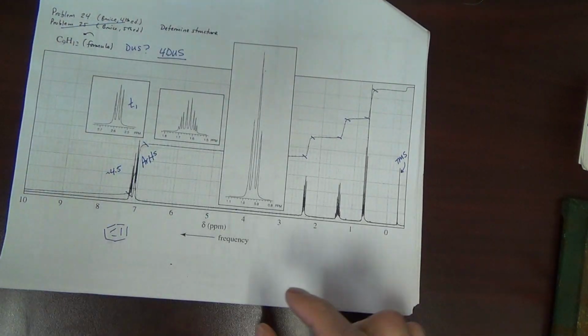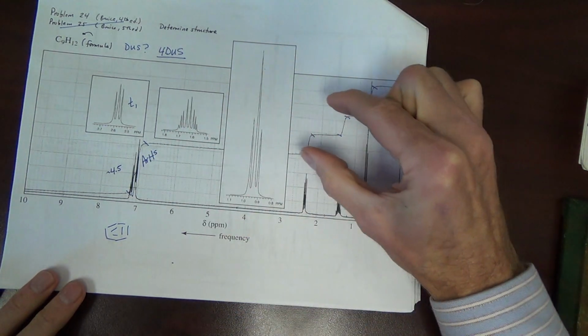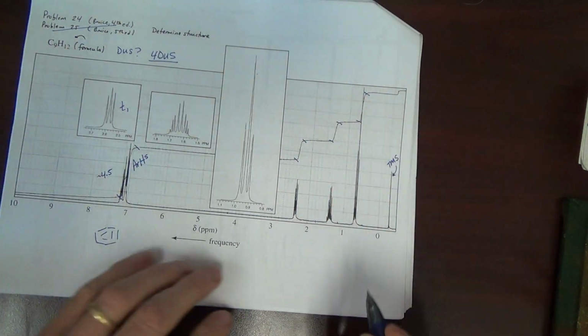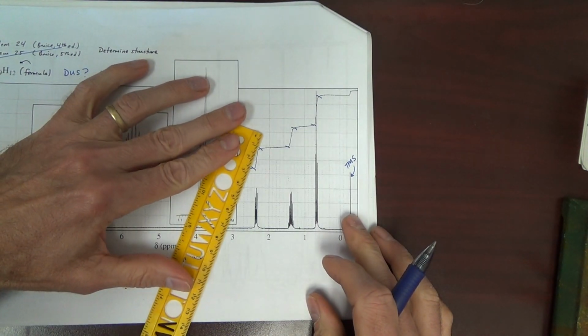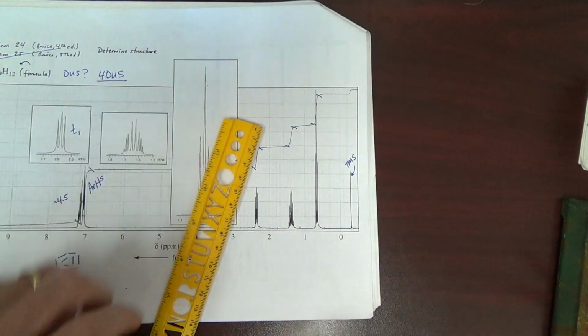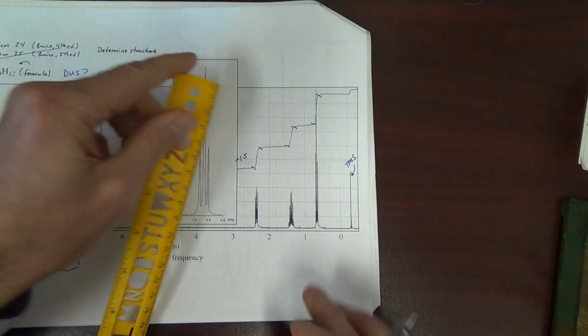We can also do this with the old finger method. It's about that long, okay? Well, it's almost twice as long as that. Well, let's look at these over here. Whatever this is, I'm going to go from 1 to 2.5. That's like about 1.5. Just in length here. I mean, what are the units? Centimeters? Okay.